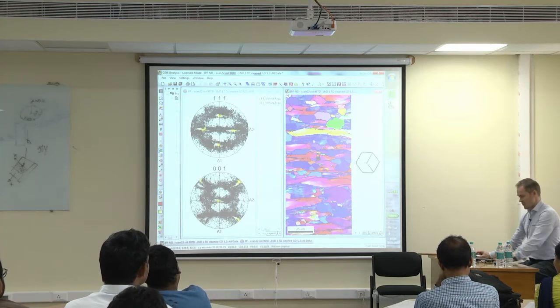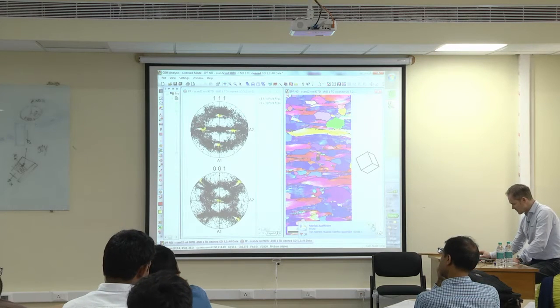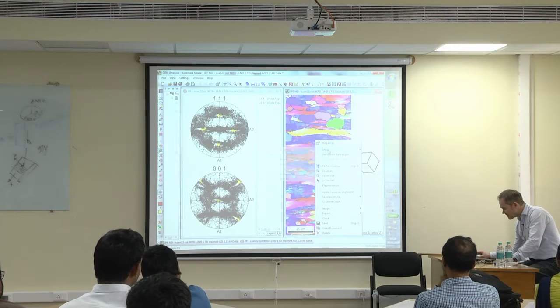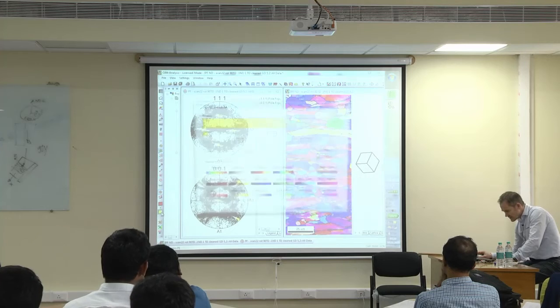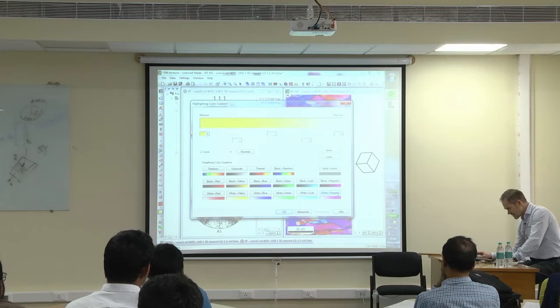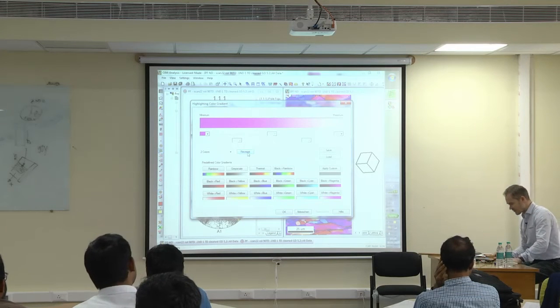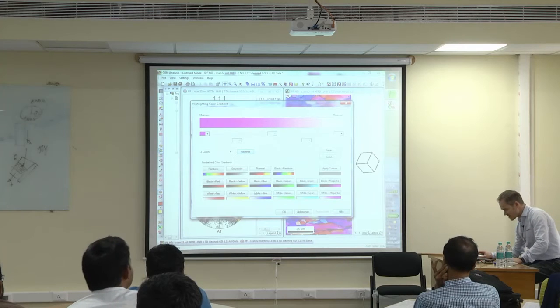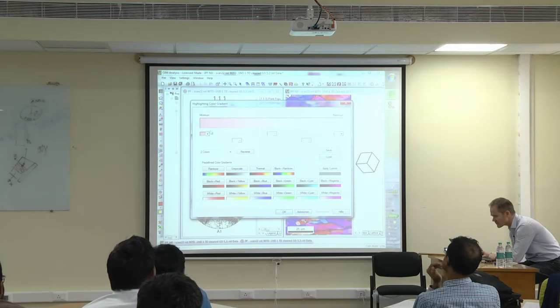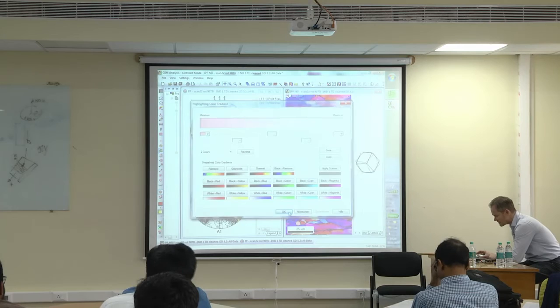So yeah, I could, of course, go and plot the blue grain behavior here once. So I click on one of these blue grains, I give it still another color. Now we are running out of colors. Usually I like very much pink. I'm such a pinky person. Okay, let's take this pink. I don't like it so much, but it is a kind of a special color. Now we do have that as well there. And let's go for a real pink. No, this is also not very clear. But okay, let's keep with this.